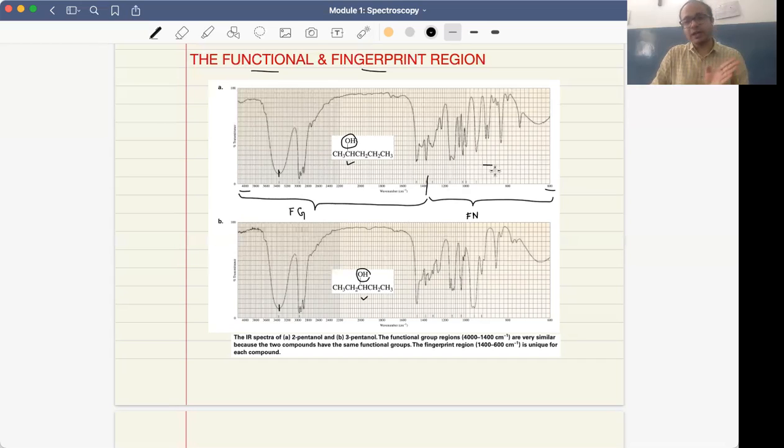So when we have a library of various compounds, their fingerprint regions are usually recorded. So whenever you isolate certain products from natural elements and compare them with an already recorded library, you can easily recognize whether those compounds are already reported or it's a new compound. So that is a very handy tool. That's why the fingerprint region is also important to us.